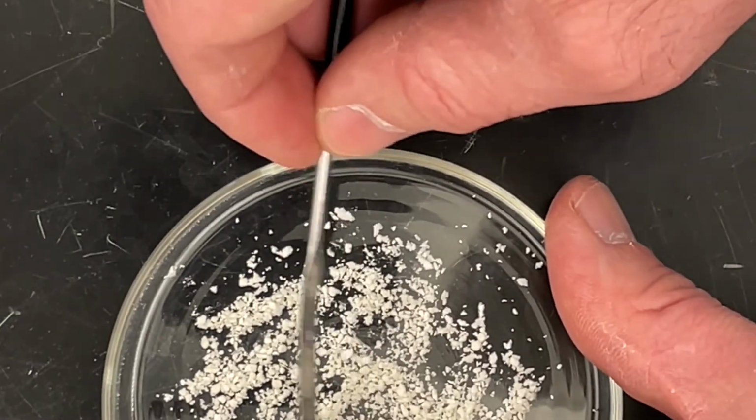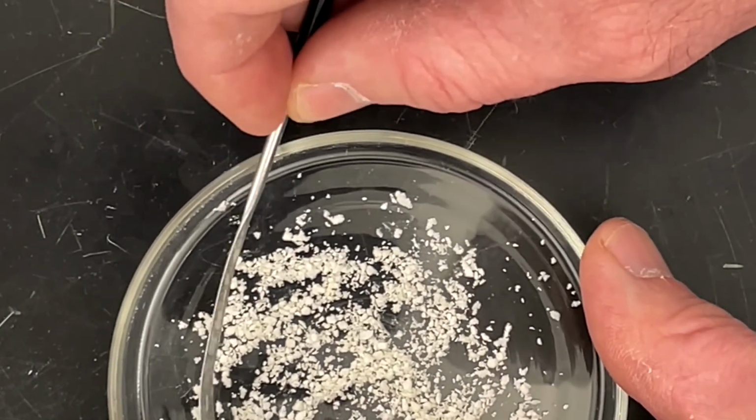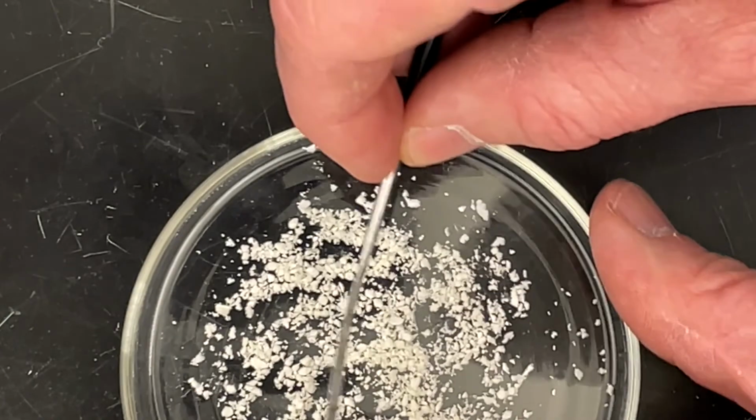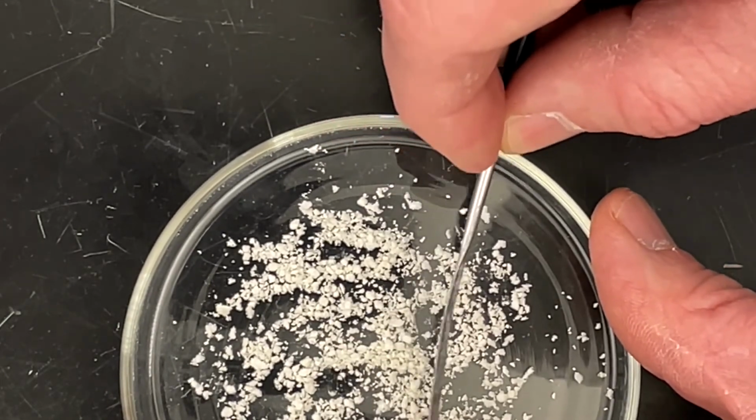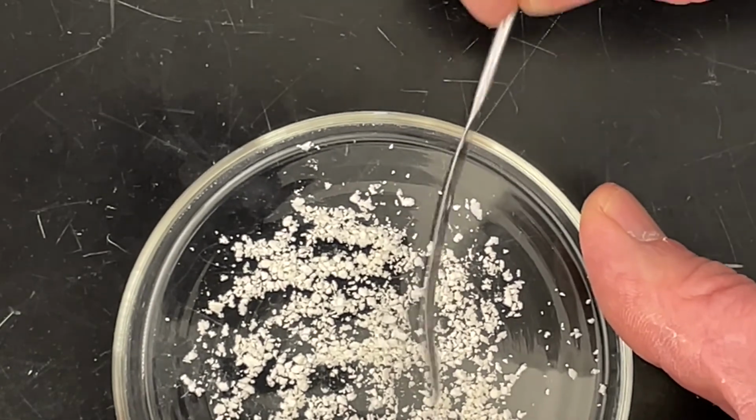And then we get to move on to making benzil. So this material will be oxidized in a nitric acid oxidation in order to make benzil. And that's kind of a fun reaction to do. All right, see you over at the balance.